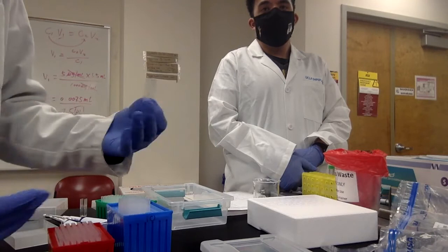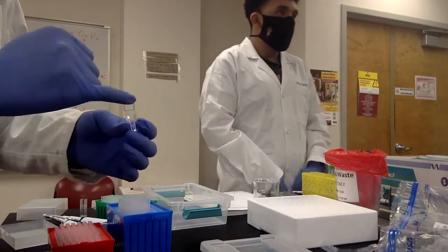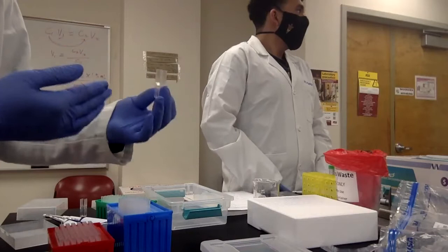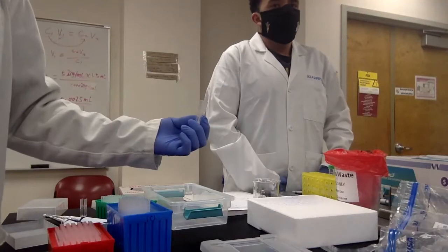And sometimes if you mix stuff within the cuvette, you probably will scratch the wall of the cuvette. You will leave a scratch on there. That can destroy the cuvette because the absorbance will never be accurate anymore. So that's why we need to do the mixing in the tube, then we transfer them carefully into the cuvette.